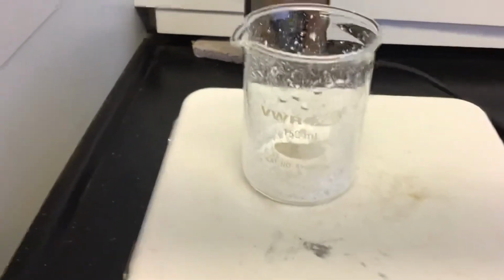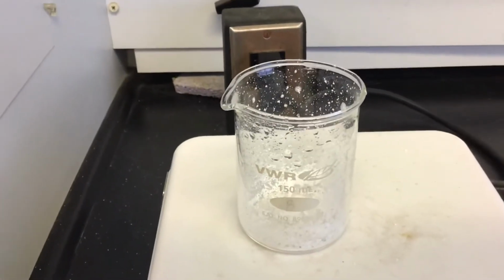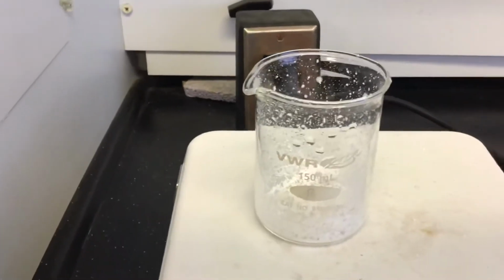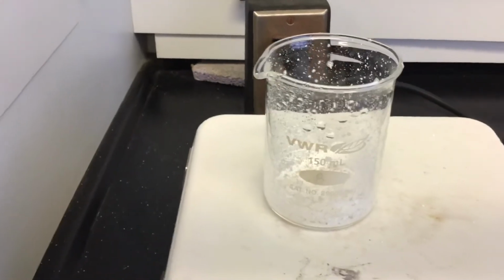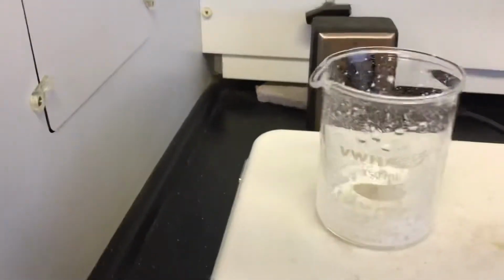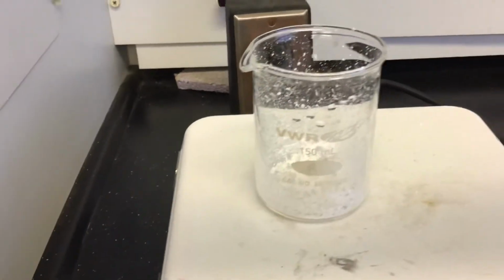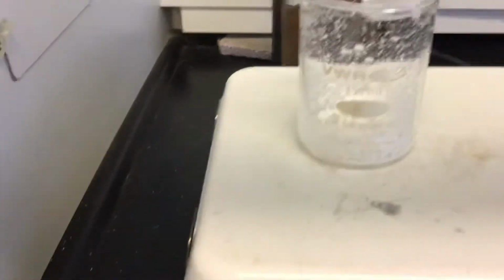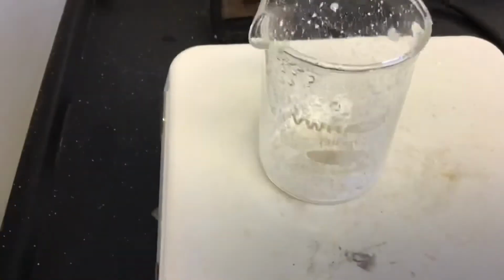So the splattering seems to have stopped, so I pulled the watch glass off. But you can tell there's condensation on the side of the beaker. So we can't take it off because it's going to have mass, because there's still water because of that condensation. So we've got to wait for that condensation on the outside of the beaker, it's actually on the inside, to evaporate. It is almost good.